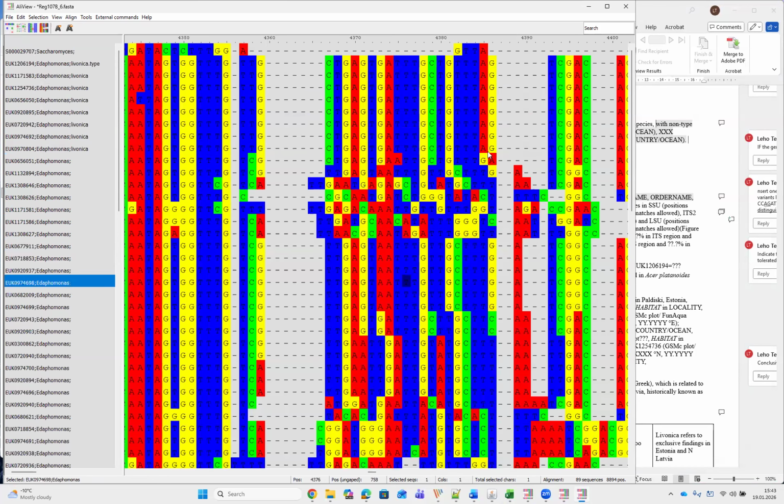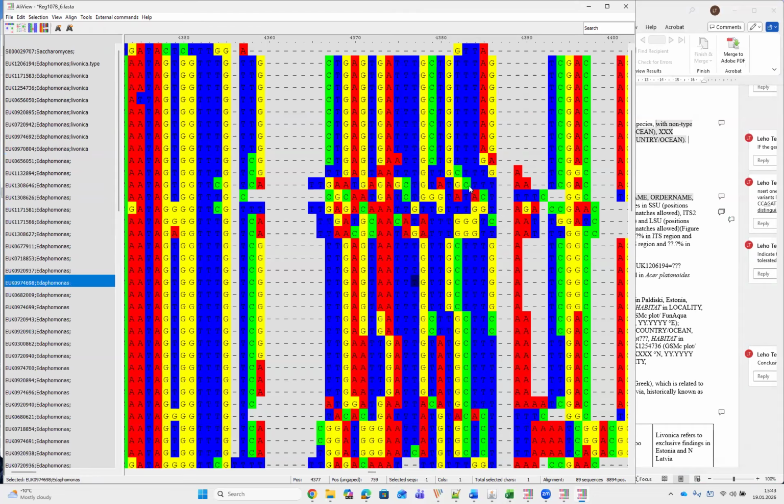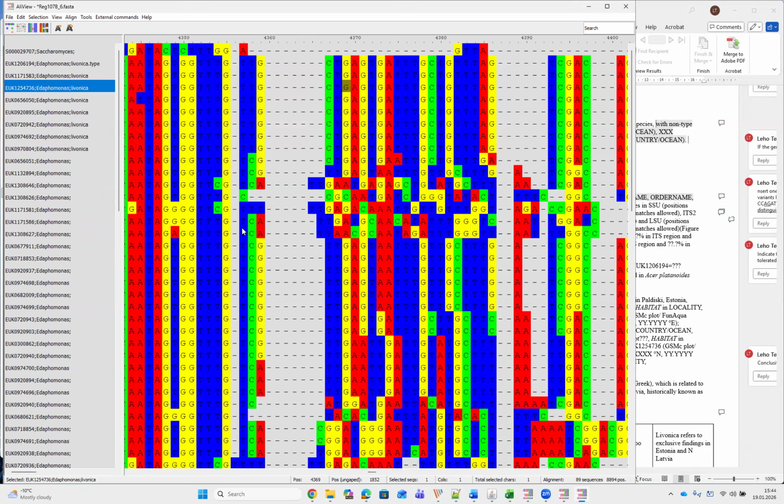So here seems to be a nice bunch, and they are already aligned. If they were scattered, we could help a bit to fit the alignment better into the screen. This would be just for visualizing purposes.